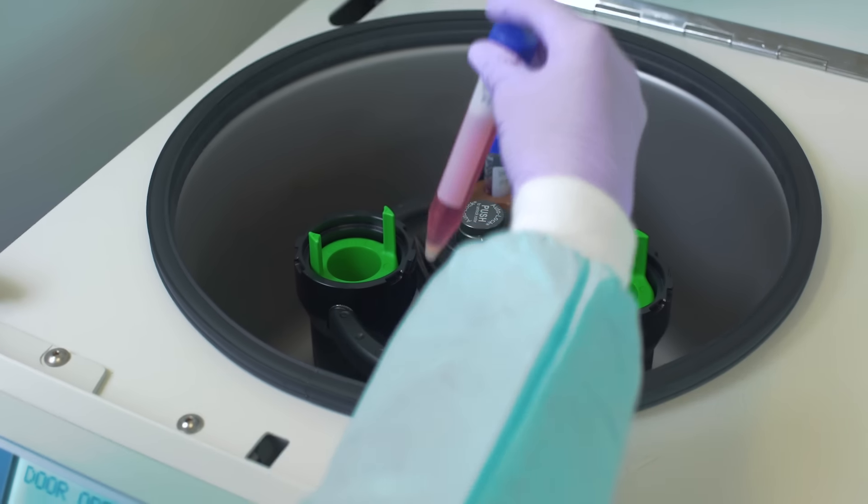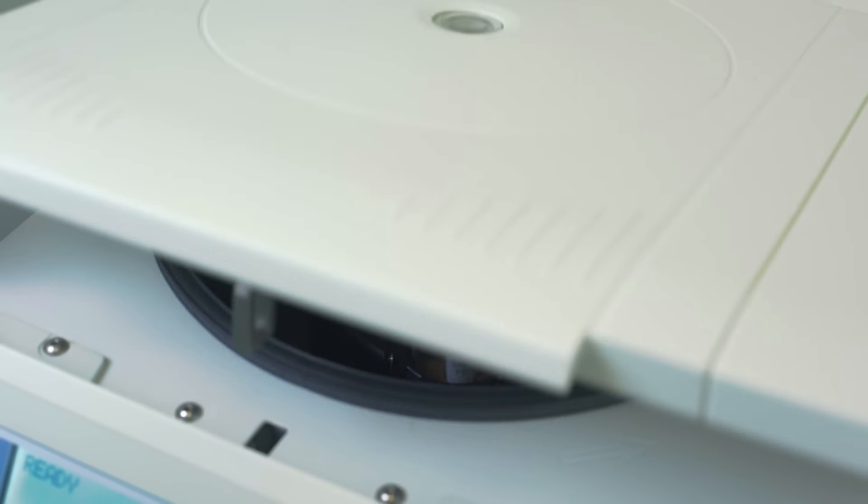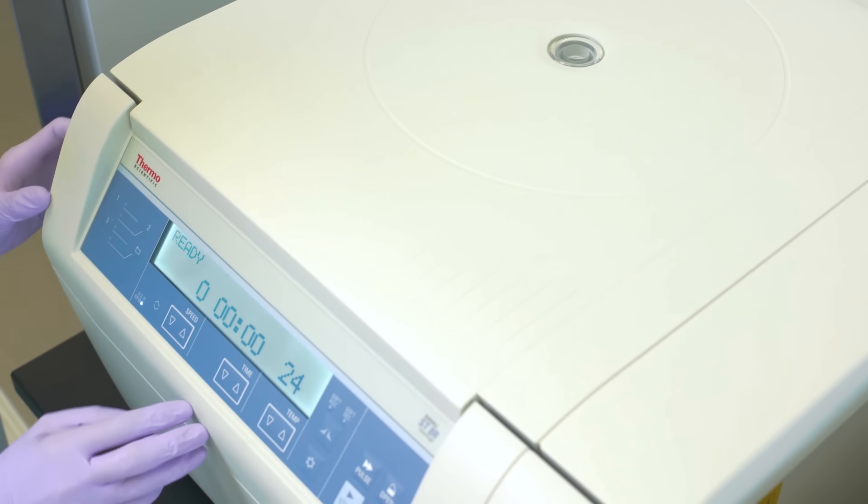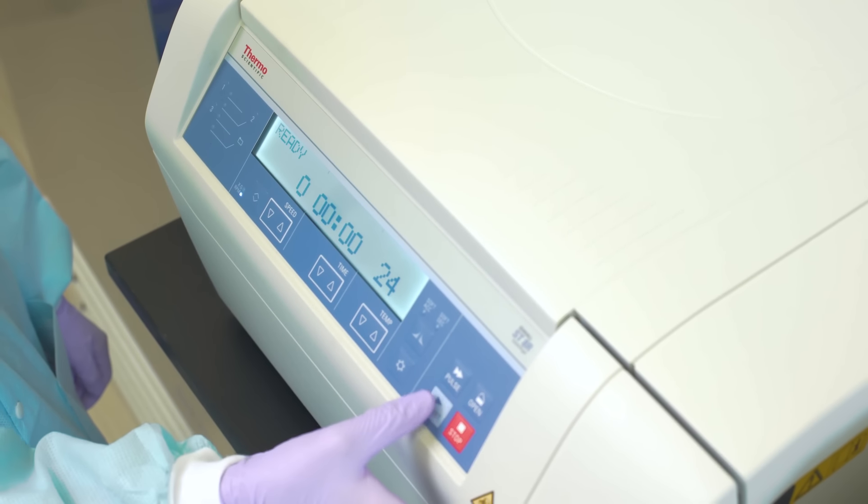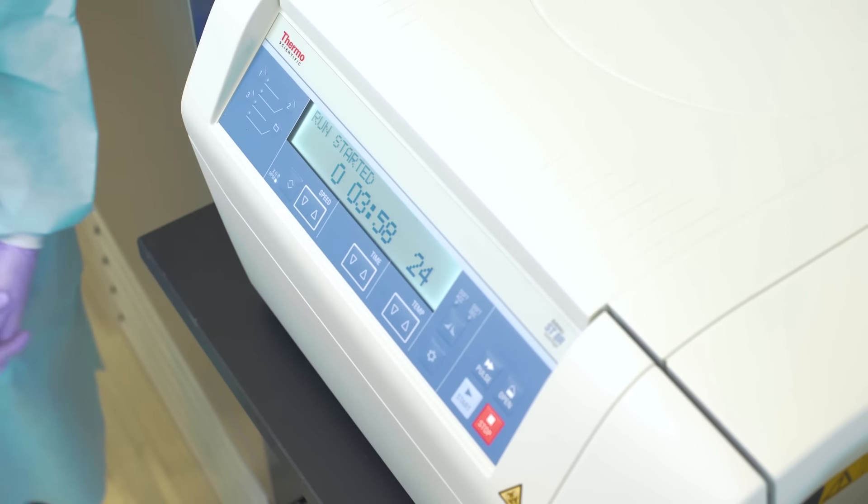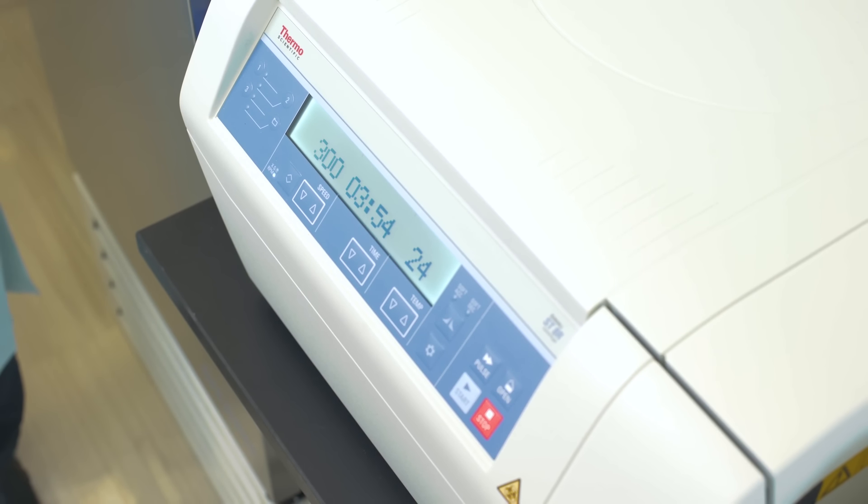Spinning the cells in the centrifuge allows removal of the freezing medium that contains DMSO. The speed and time may vary based on the cell type. Some cell lines are too delicate to spin, so this step could be skipped in certain cases. Follow the instruction of your laboratory manager if your cells are very delicate.